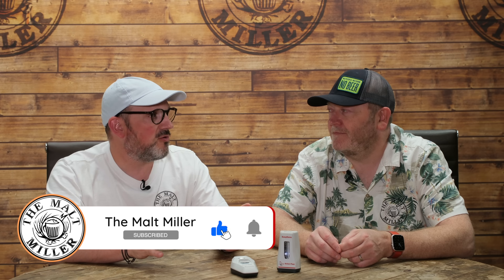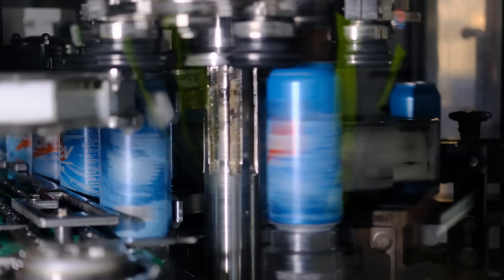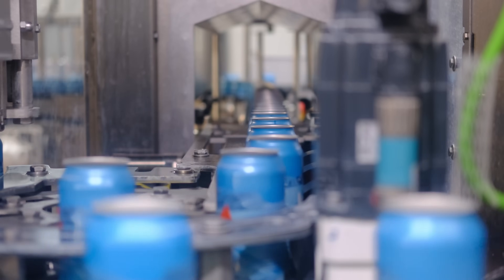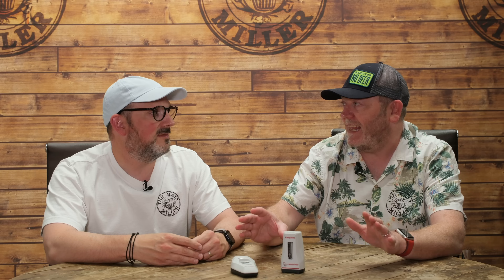So Martin, for anybody watching this that hasn't heard of Anton Parr or the products we're going to be looking at today — who are Anton Parr? So James, Anton Parr are a lab equipment producer based in Austria. If you go to any decent sized professional brewery, they're going to have stuff there to test their batches, test the ABV, test the gravities — it's always there in their lab.